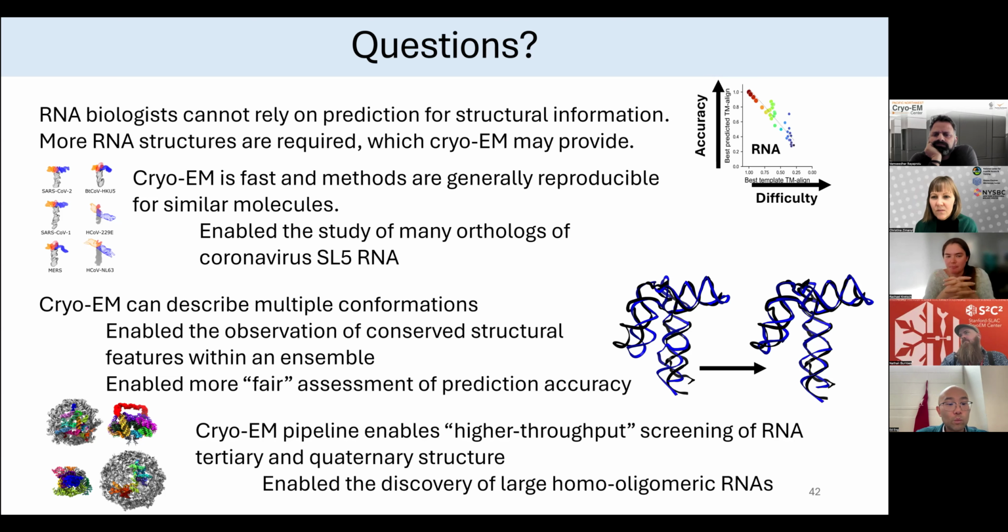So that's one phenomenon. The reason the backbone at similar resolution sometimes is not as well resolved, and this is talking about a 3-ish angstrom resolution, is because it does have a phosphorus, so that is good contrast, but it also has negatively charged oxygens. Those can contribute negatively to the overall signal. So the phosphorus and those oxygens are kind of combating each other. And that is why in certain resolution ranges, you probably see not as great backbone density as you would expect given the phosphorus.